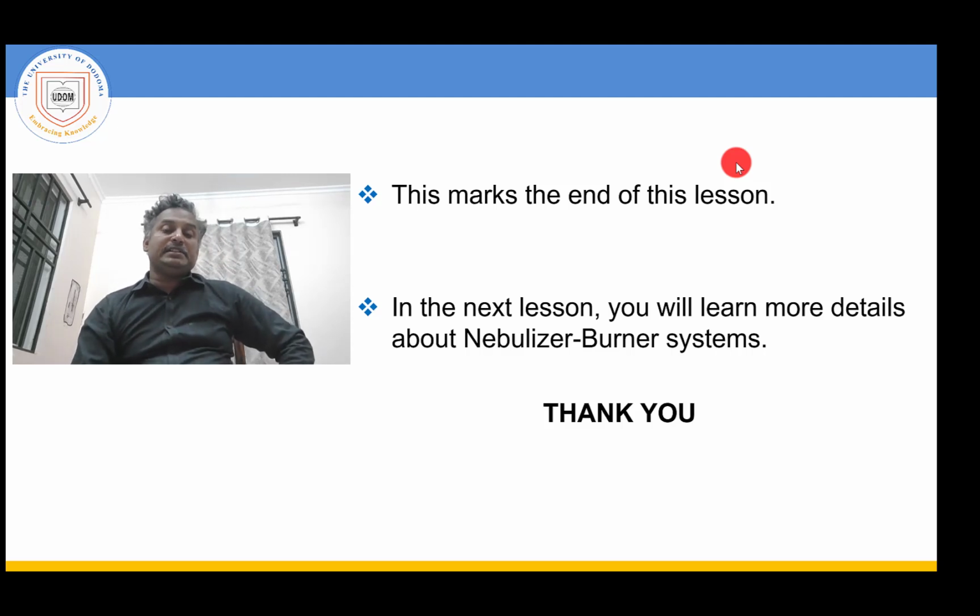This marks the end of this lesson. In the next lesson, you will learn more details about the nebulizer burner system. Already in the general instrumentation, I told you the purpose of the nebulizer burner system. It will take the sample to the flame. How it works and what the different types of nebulizer burners are, I am going to explain to you in the next class.